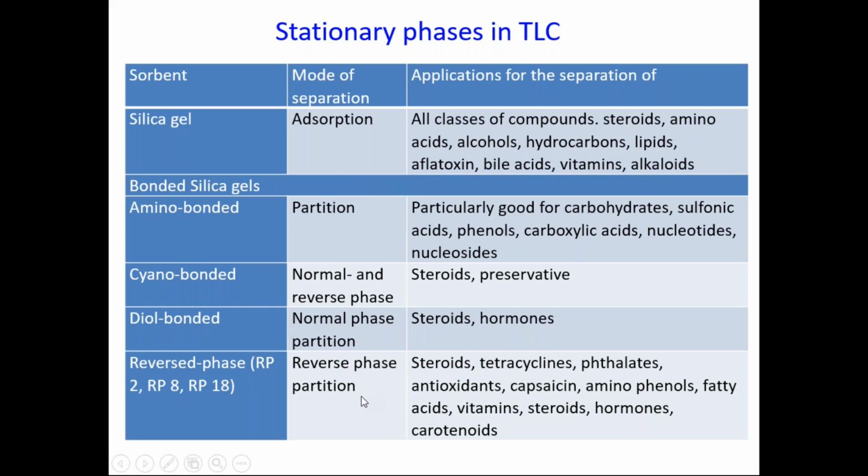When I take the class on high performance liquid chromatography, I will explain in detail what is normal phase and what is reverse phase partitioning. But using these techniques, a large number of analytes can be separated from their mixture.